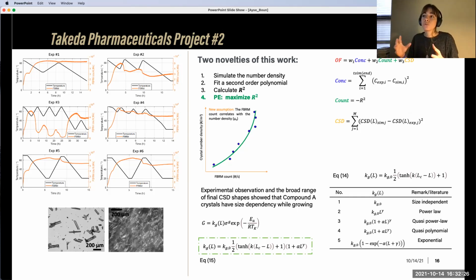And all these tools are calibrated by using spherical crystals or spherical particles. And when you use these needle-like crystals, these long materials, you have discrepancies, and that's the challenge in these data-driven frameworks for pharma, because most of the time the drugs have these needle-like crystals.